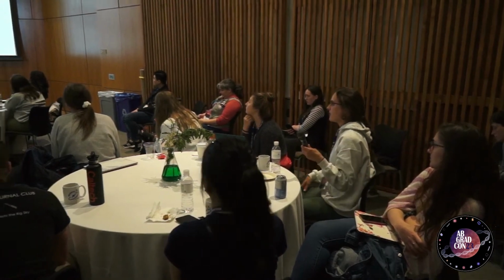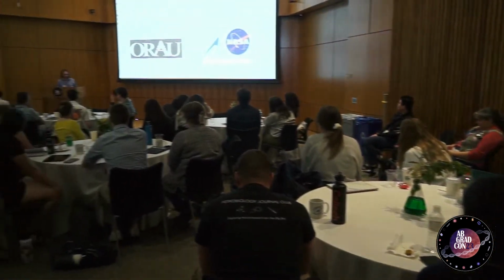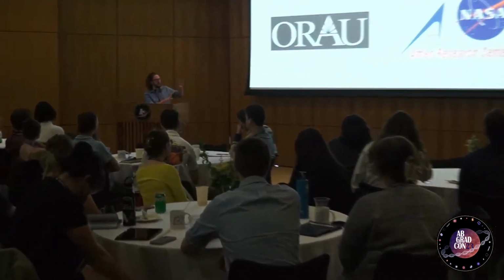Yeah, so it's the design that we had in mind for sample prep here, and when I say we, it's not us. This was built around the Europa Lander specifications, but essentially you'd have a sample cup that would collect an ice sample and melt it down, and so that was the initial thoughts behind the design here.